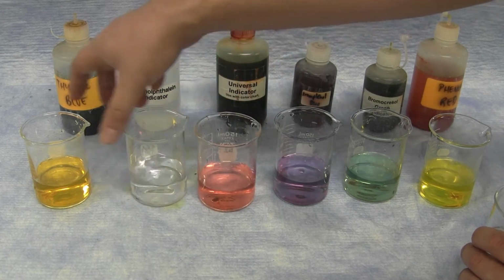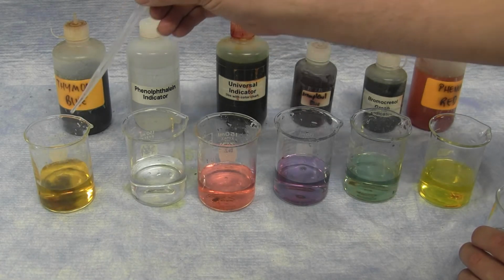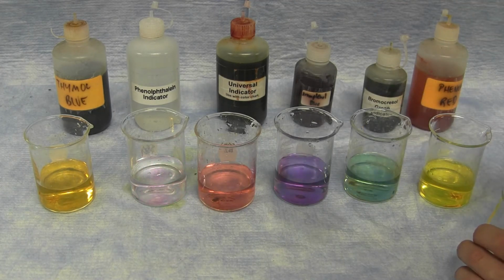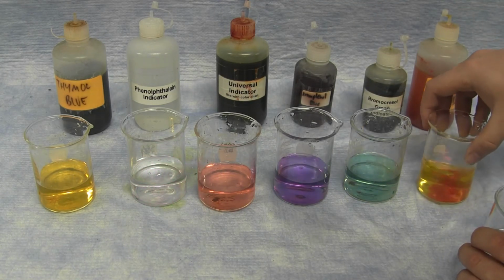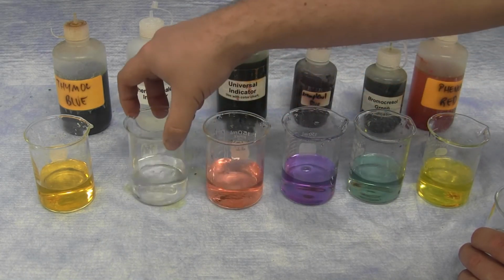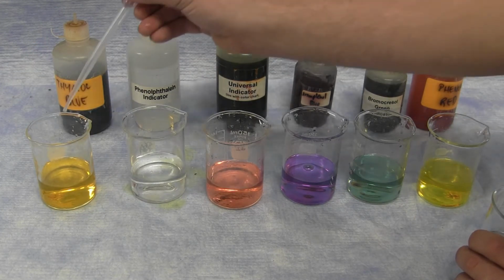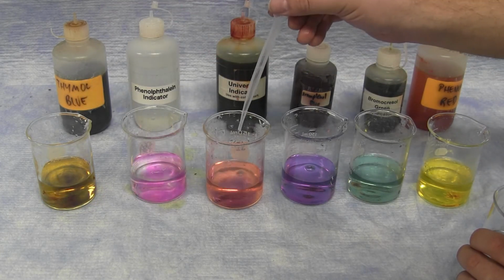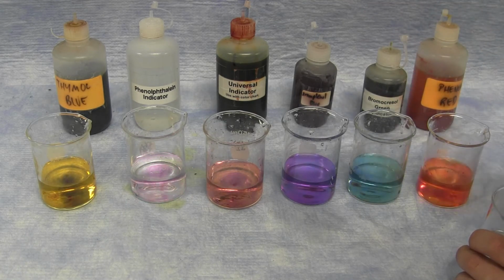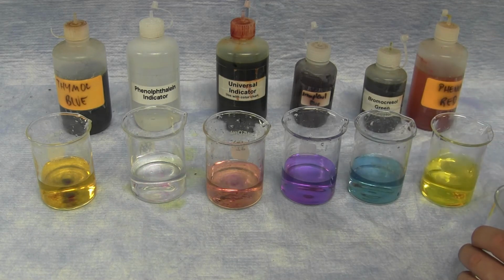You can begin to see a change now in the bromophenol blue. However, the others still remain relatively close to their original color. The universal indicator is also beginning to change. Now, the bromocresol green is beginning to change its color.